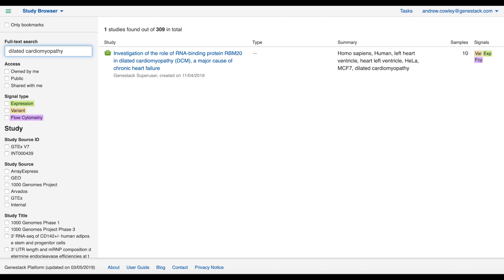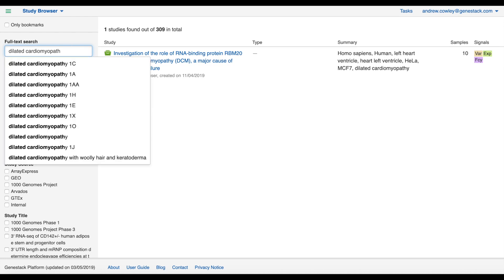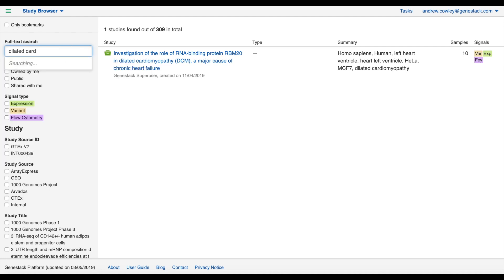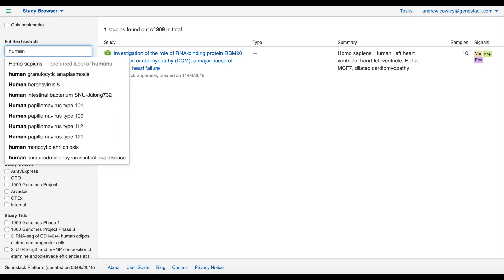Human, for example, should really be described as Homo sapiens. So if I type human in the search box, the autocomplete suggests Homo sapiens as a preferred label of human.